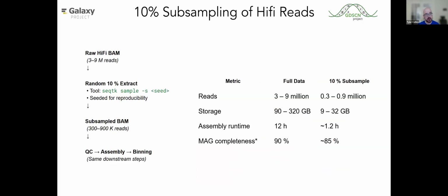We're also going to be subsampling those reads. So this is just some of the protocol. We're basically taking a 10% sample of our read data from that Hi-Fi. We're just doing this to reduce the data load and runtime. The bigger your sample, the longer things take to run. In theory, this should keep the same coverage and same species. We've been testing to make sure that it still provides good enough results, but this step is mostly just to save us a lot of time.